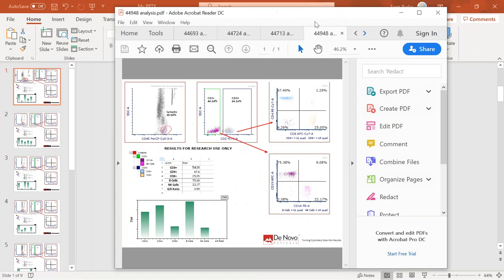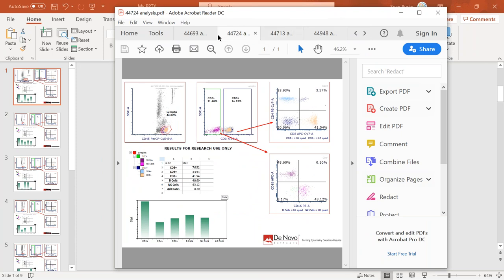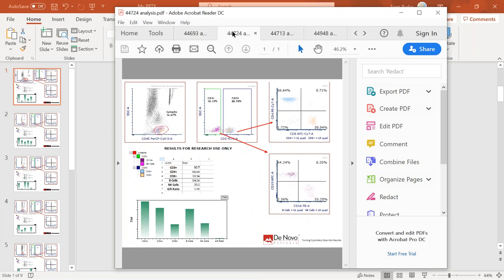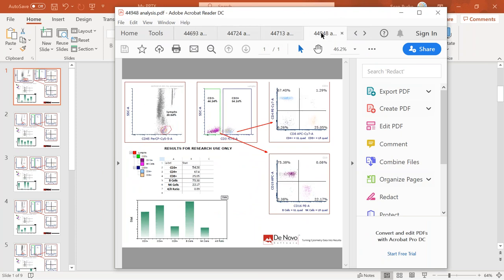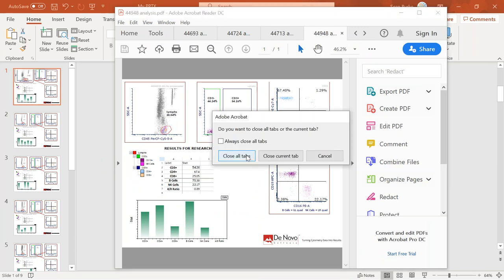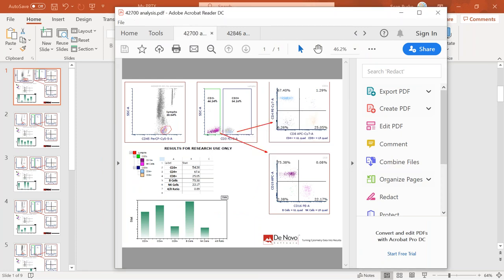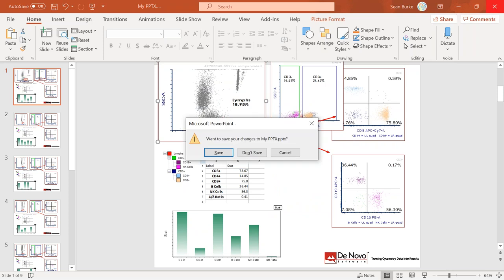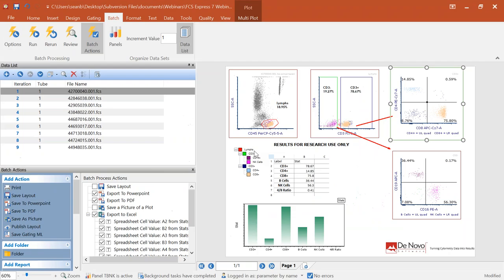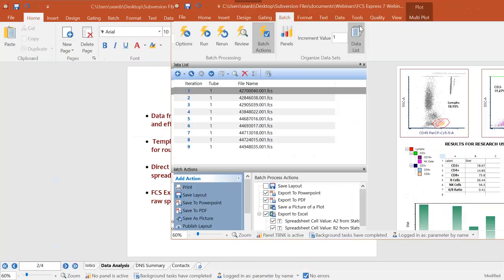Additionally, in that batch, we've created separate PDFs for all the samples, so if we need to pull up one specific sample, we can do that very quickly. To recap the workflow: it's simply drag and drop data files into our data list, adjust our gates as we need, click run on the batch process to generate results. That's really what we want to see you being able to do in the software.